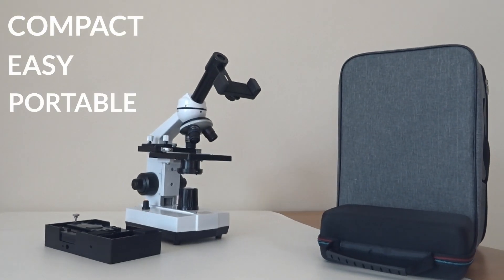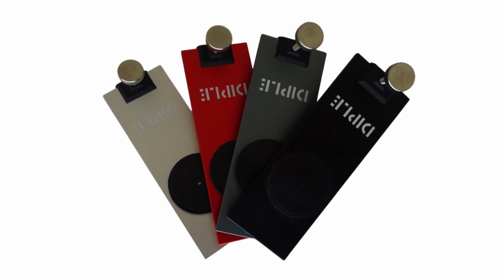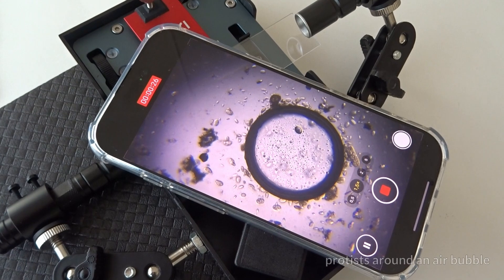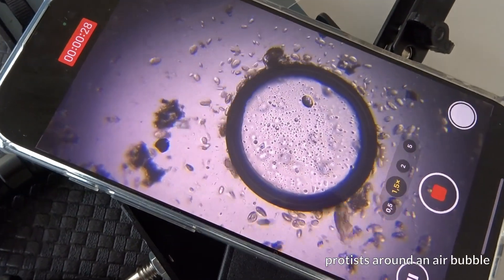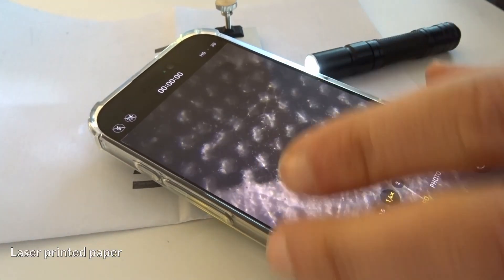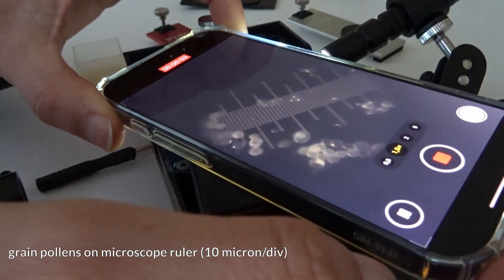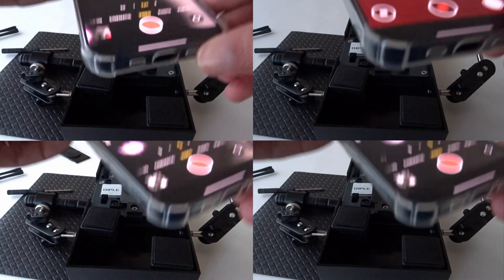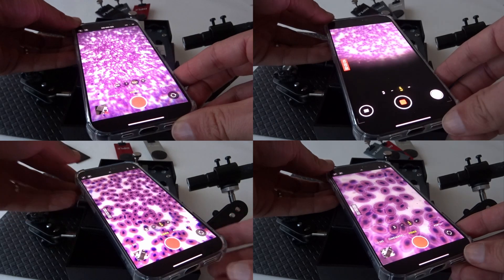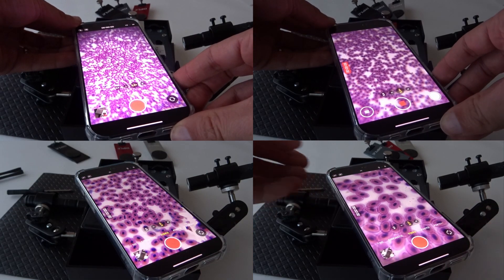Compact, easy, and portable. Complete with up to four different lenses and three light sources. Dipple 2 is now for bright field microscopy, polarized light microscopy, reflected light microscopy, and dark field microscopy. With four different lenses and four different illumination modes, you can explore the microscopic details around you like never before.